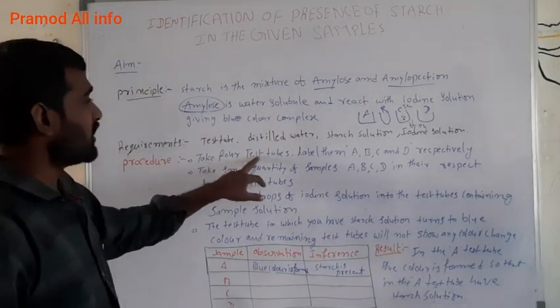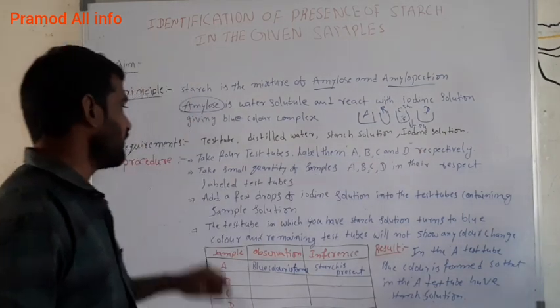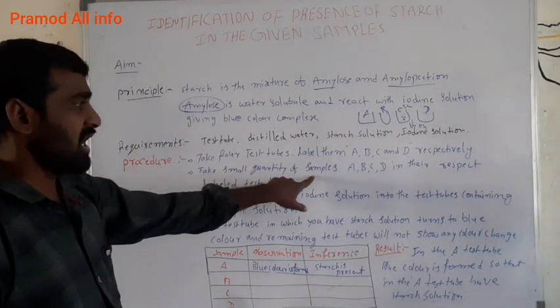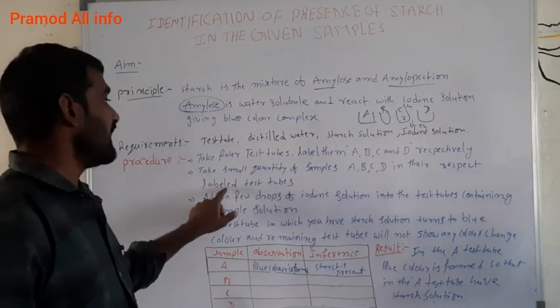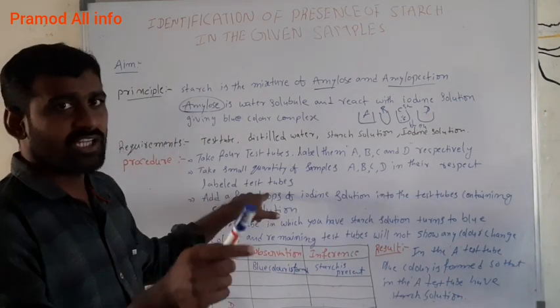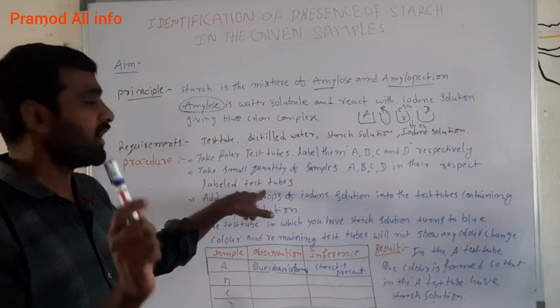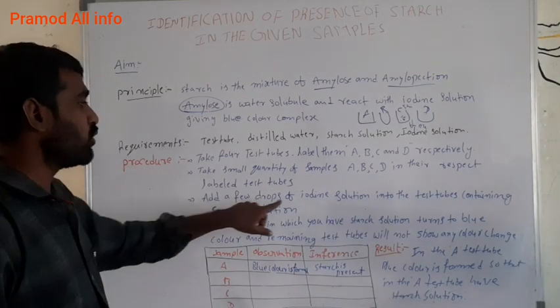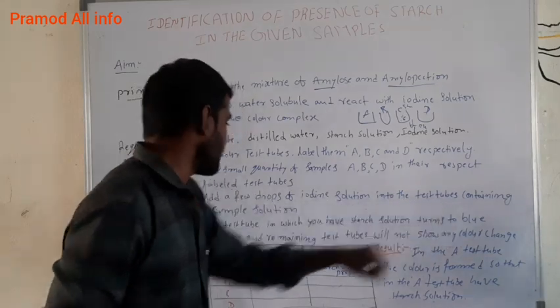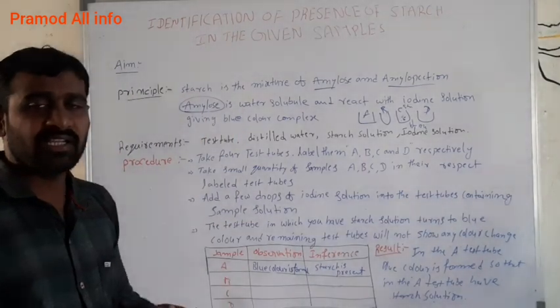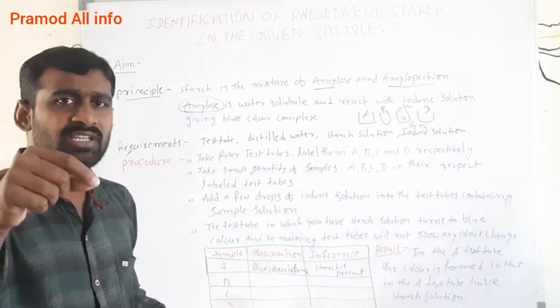Take four test tubes, label them A, B, C, D respectively. Take small quantities of samples A, B, C, D in their respective labeled test tubes. Then add a few drops of iodine solution into all the test tubes containing sample solutions.